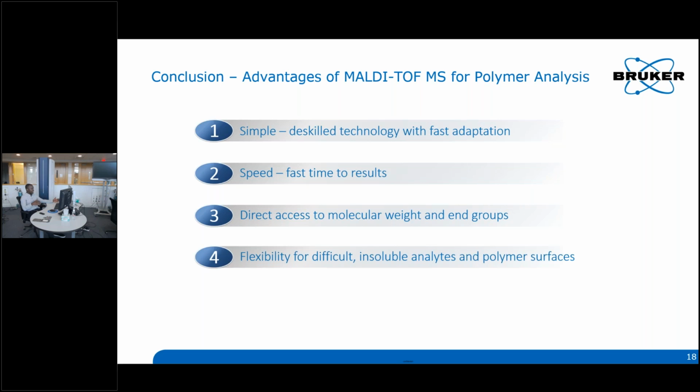Very flexible technique for difficult and insoluble analytes. You don't need to have your sample dissolved in any types of solvent to be able to analyze it using MALDI, as opposed to other techniques used for polymer analysis. And it also comes with a complete package of industry standard software such as Polytools, like we saw, Flex Control and Flex Analysis for data acquisition and data processing as well.